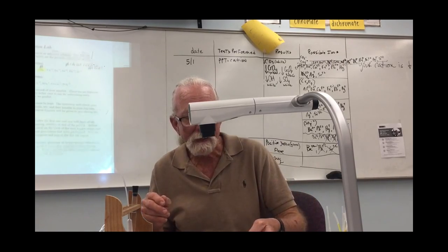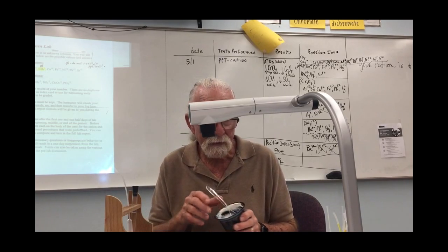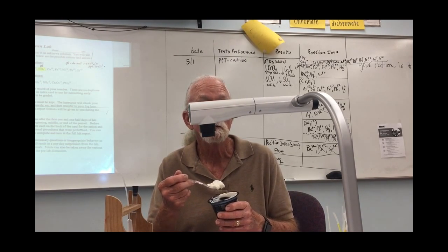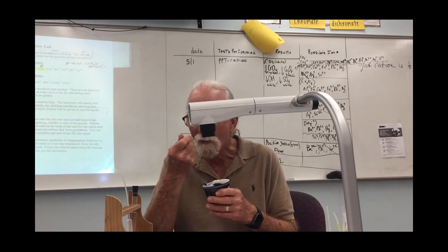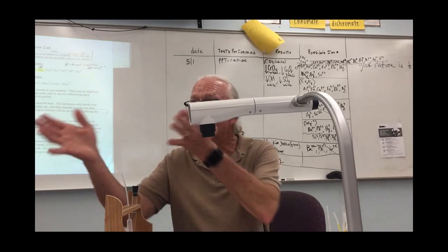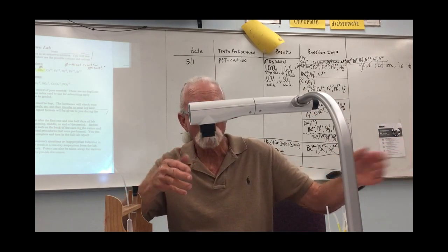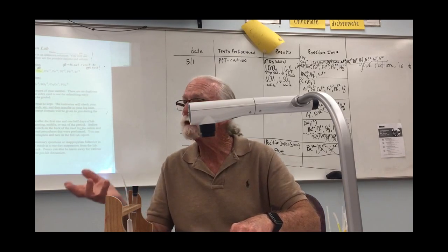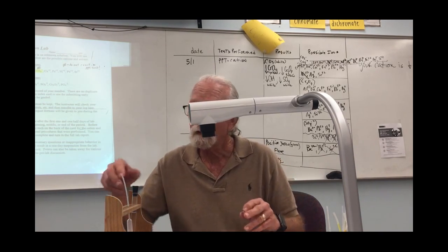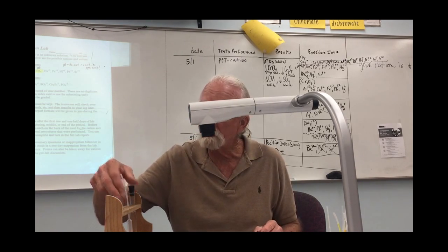So you'll need this out to make notes on. And I will today go over the cation precipitation part of this. Half of you will be doing cation, half of you will be doing anion. Let's assume today that you're doing cation. All right, you get your unknown. I give you your dropper.